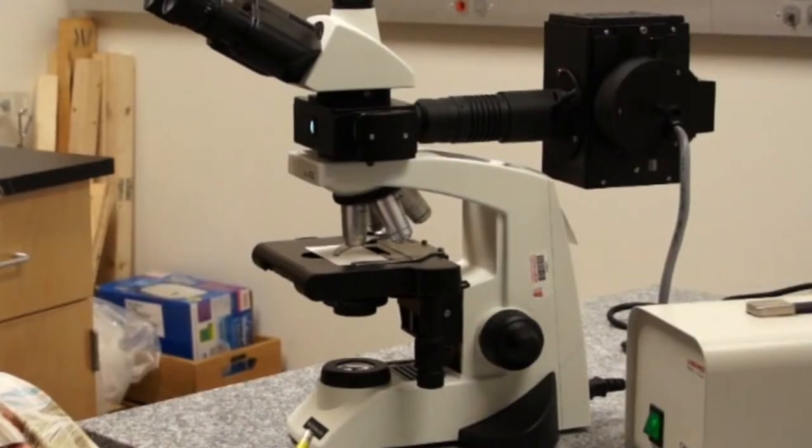We are going to begin our discussion of microscopical principles by using a standard compound microscope. Now you're probably familiar with dissecting microscopes, which you've used in some of your labs to dissect organisms or other things. That's a very low power magnification instrument, and this is a different instrument.